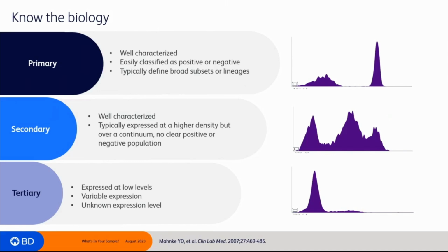So in this case, pairing CD58 with the right fluorochrome will help you recognize the subtle changes in antigen expression, and in turn make the right diagnosis. You could tell if the patient has residual B-ALL cells in the bone marrow after treatment.